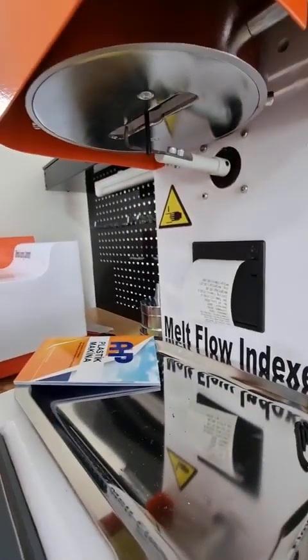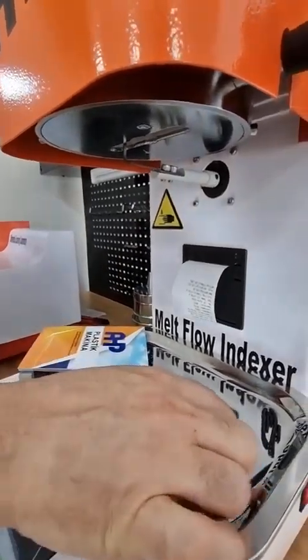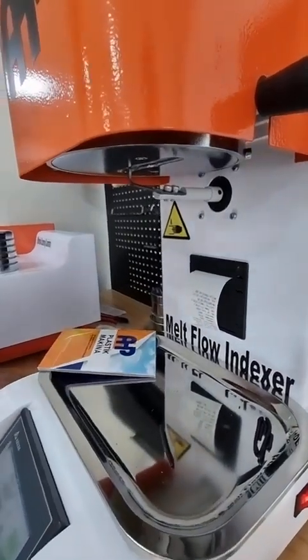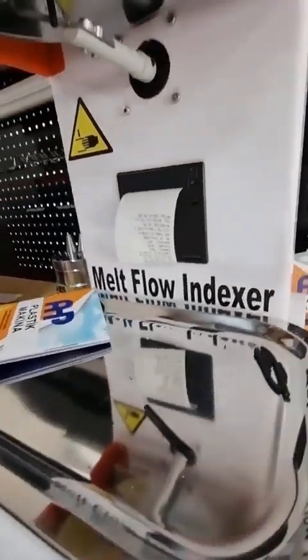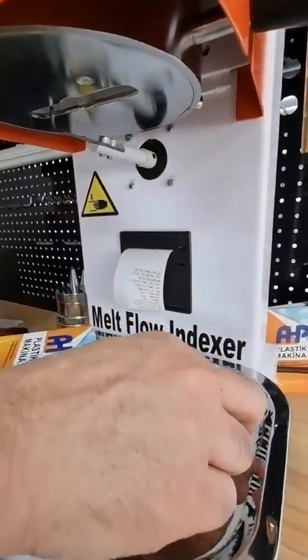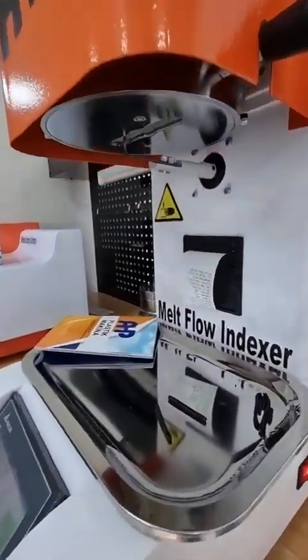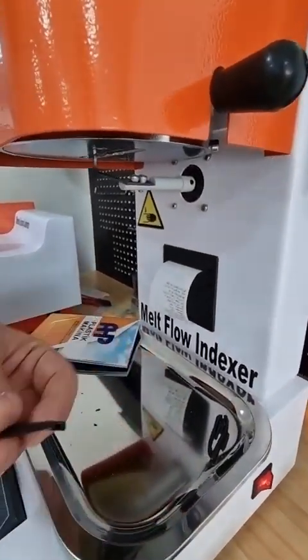The timer is counting down — after 120 seconds it will cut the first sample. Four, three, two, one — we have the first cut. We'll wait for four more cutouts. Now we're going for the second cutout. We can measure the melt flow rate from just two pieces. Let's go to the balance.